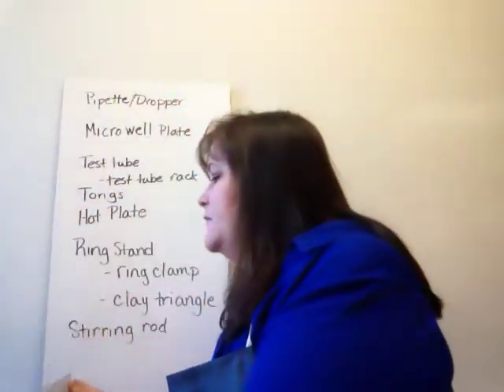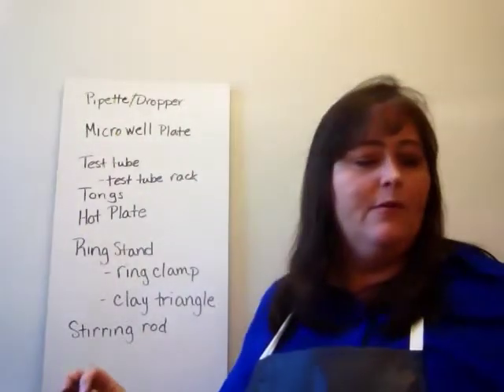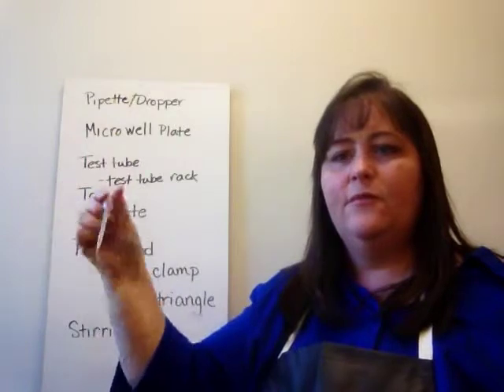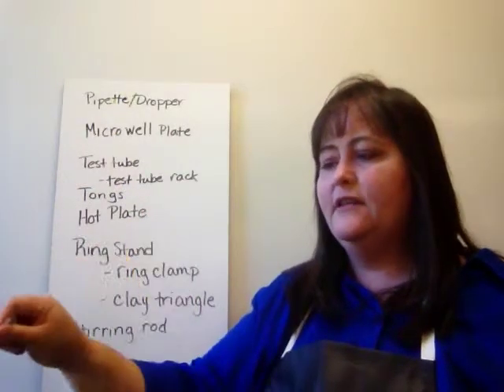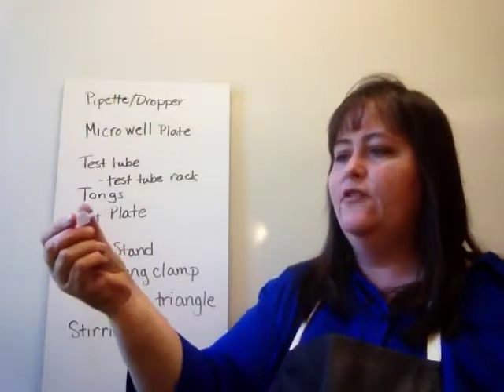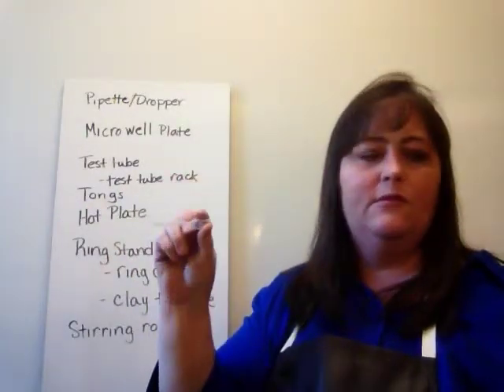The next piece of equipment we're going to use is the pipette or the dropper. This is a pretty simple piece of equipment. It looks like this, just like any dropper you might have seen. Squeeze it, put it in the chemical, let go of the bulb, and then you'll have a dropper full of liquid that you can move from one place to another.